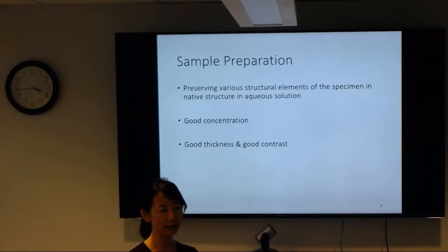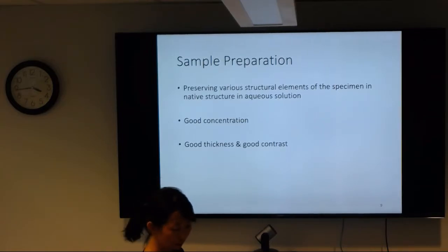On top of that, we want to make sure imaging is not that hard, so we want the concentration to be good, and we also want to make sure the ice thickness is good and the contrast is good, so that you can have those pretty images you can show off.